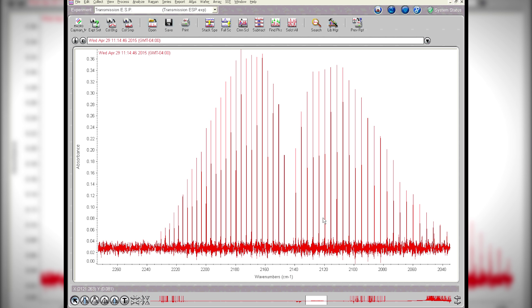There you see the high resolution lines of carbon monoxide as the molecule rotates and vibrates at the same time. This is the rotation-vibration spectrum of carbon monoxide — a high resolution spectrum. If you were running ammonia, HCl, or anything else, you would run them pretty much in the same way. So that's gas phase transmission spectroscopy.